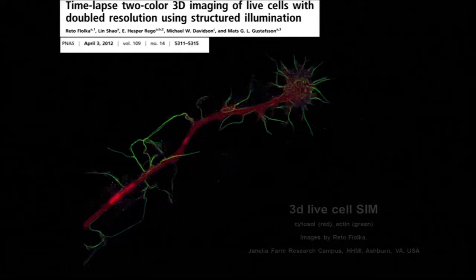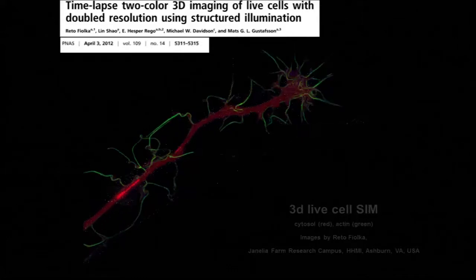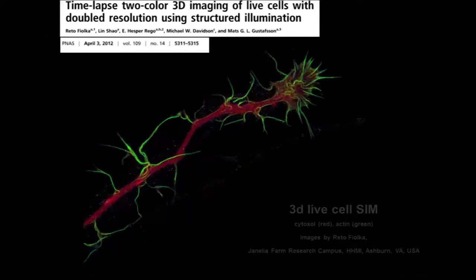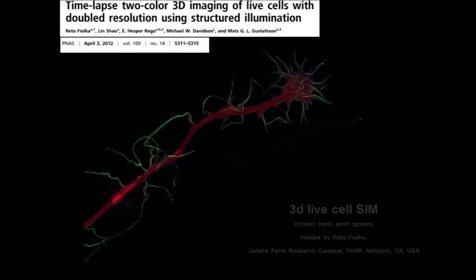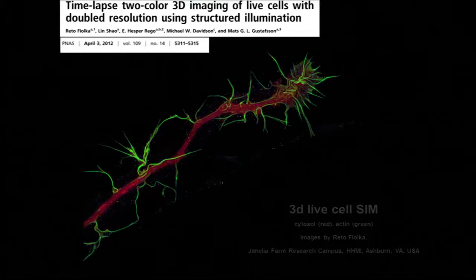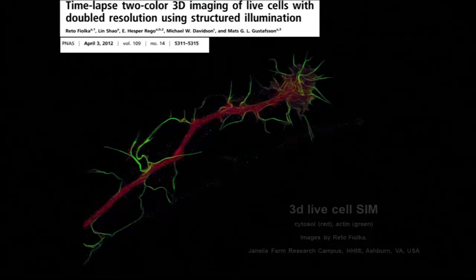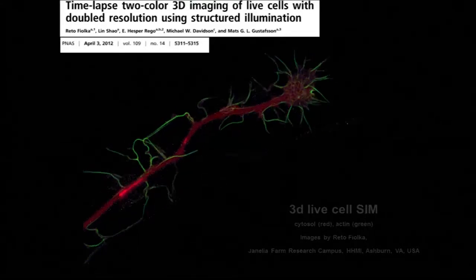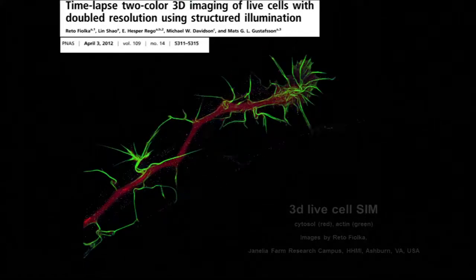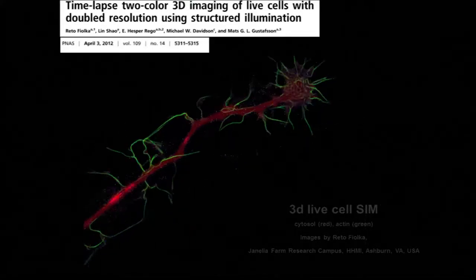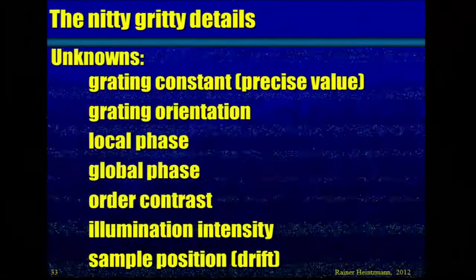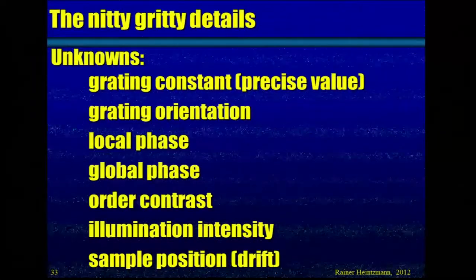Another nice example from Mats's group: multicolor structured illumination of growth cones of neurons, showing actin and the cytosol labeling.